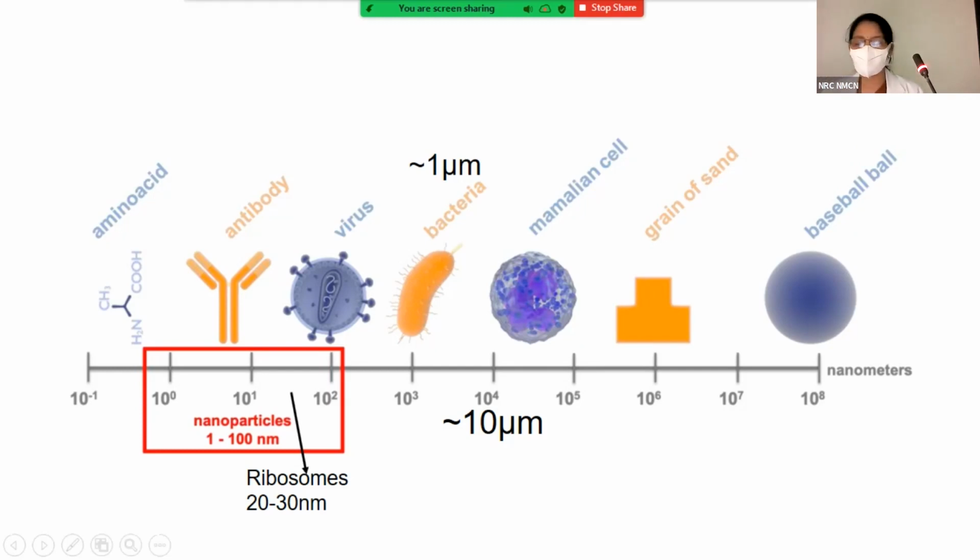I showed you a virus particle, right? So this is what an electron microscope can do. It can show you particles which are very small. We can look at ribosomes under the transmission electron microscope. What is the size of the mitochondria? I know you will not remember that. Bacteria can be seen by a light microscope also, isn't it? The size of a mitochondria is around 0.5 to 1 micron. So practically speaking, you should be able to look at a mitochondria in a light microscope, isn't it? If you see a cell, you can see those granules which represent the mitochondria.